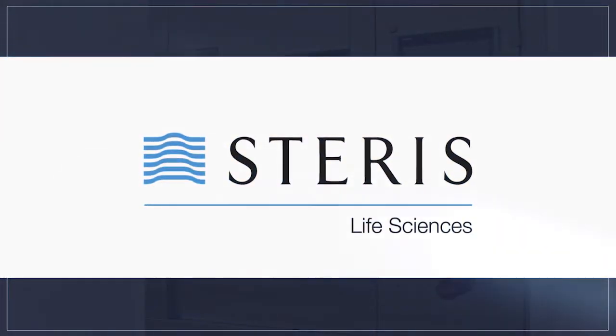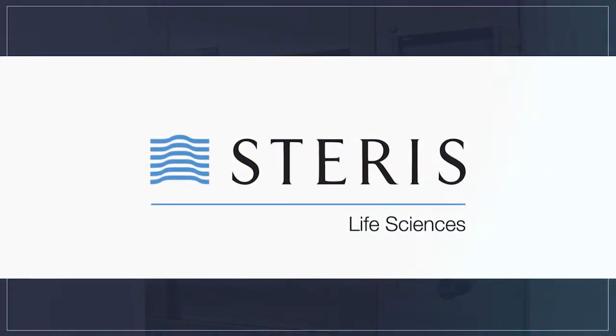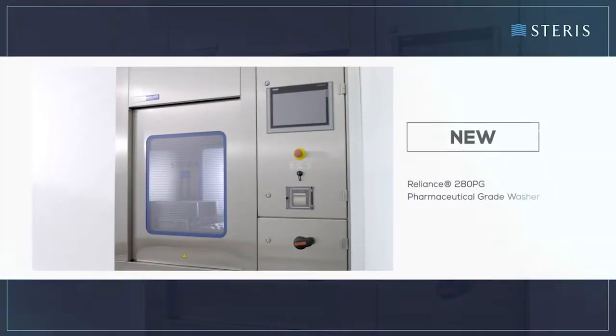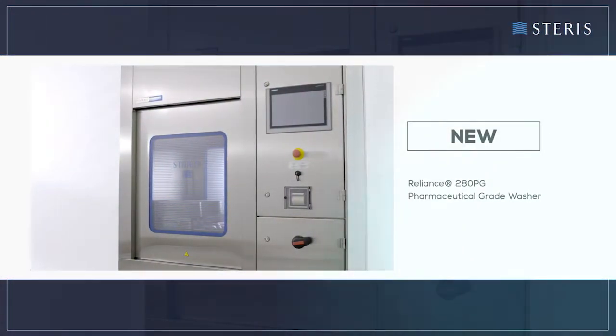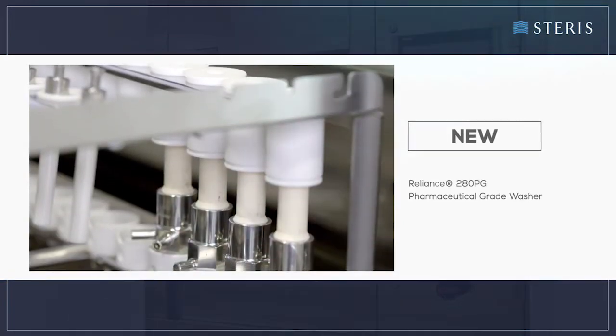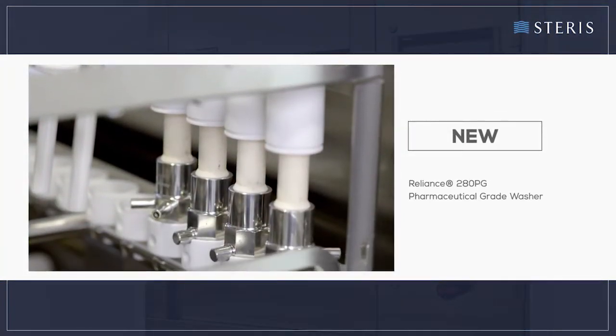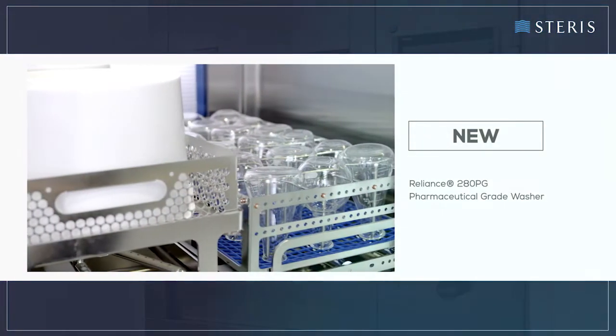Introducing a new high-performance parts cleaning system from Steris. The Reliance 280 PG pharmaceutical grade washer was designed to clean critical components commonly used in pharmaceutical manufacturing, such as filling line and packaging machine parts, tanks, containers, glassware, and more.